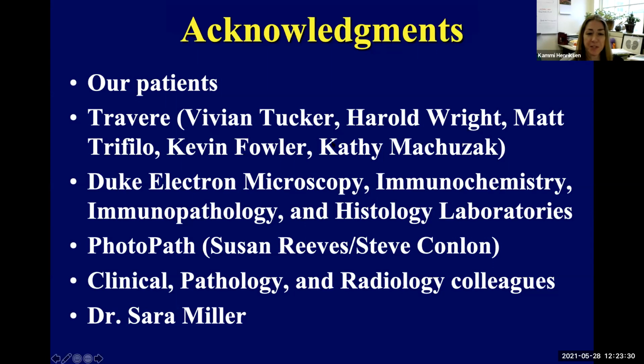Excellent presentation. What's your opinion about Bouin's as a fixative? I have not used Bouin's, and I don't have an opinion, and would encourage anybody else who's logged on who has used it to say. There are some alternative fixatives that some centers use.